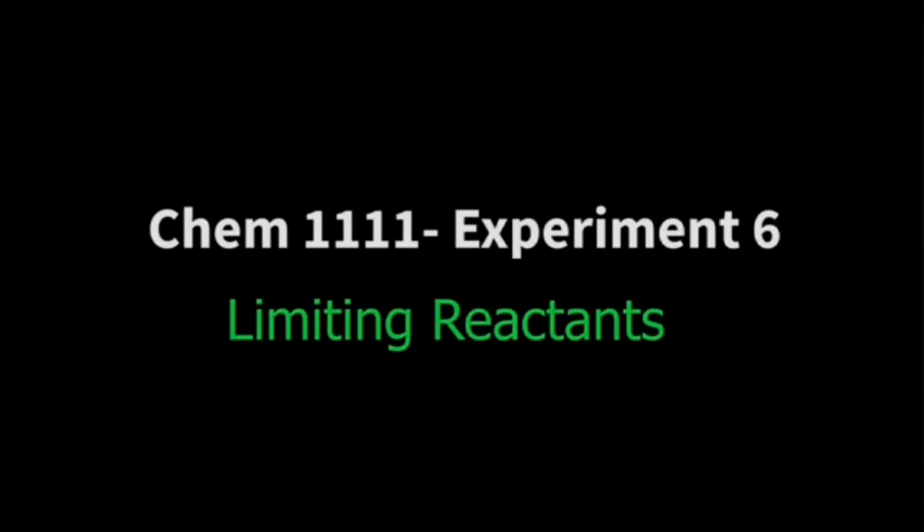Hello everyone. So this week we are going to do experiment 6, which is limiting reactants. In this experiment you're going to learn how to observe and interpret a precipitation reaction, and we're going to learn the technique of vacuum filtration to separate a solid from a liquid, and also interpret the molecular, total ionic and net ionic equation for a precipitation reaction. And then we're going to learn how to calculate the theoretical yield and the percent yield for a chemical reaction, and identify the limiting reactant in a chemical reaction.